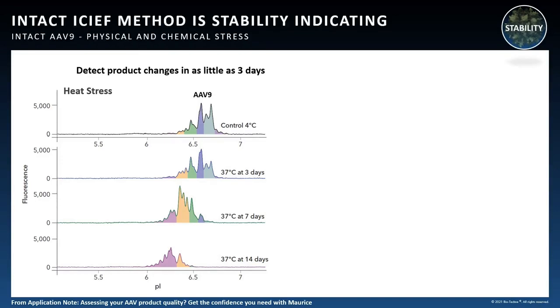Given that AAVs require low pH for activity through structural rearrangement, these data suggest that changes in AAV particle stability could be due to structural changes in the capsid. This method can also be used for formulation development. From the method, as can be seen from this series, the overall pI of the intact particle can be estimated to be approximately 6.6.